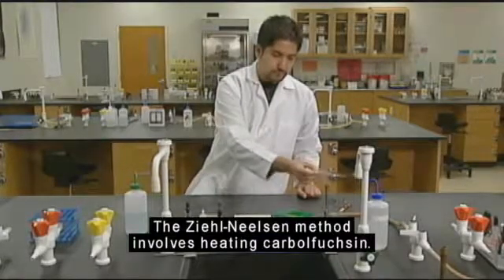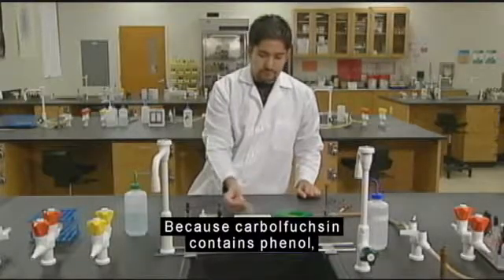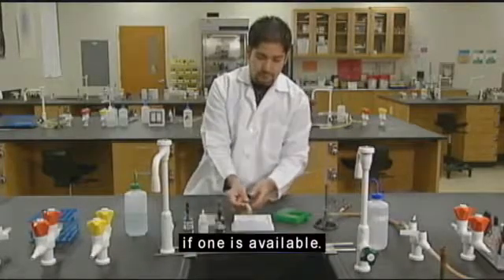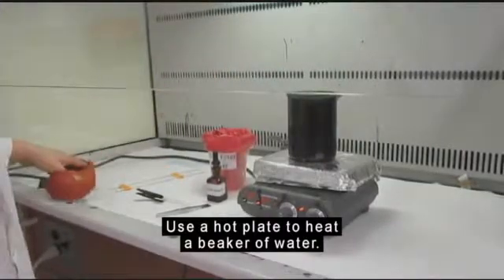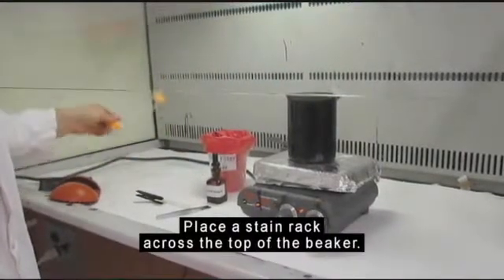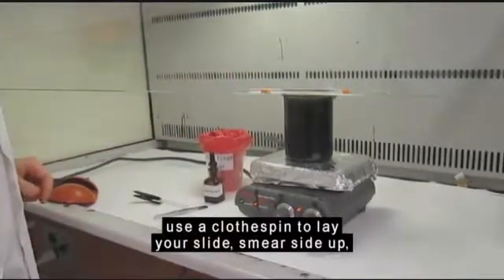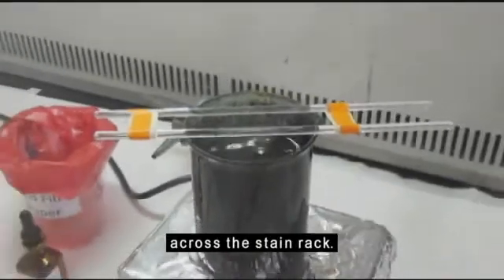The Ziehl-Neelsen method involves heating carbolfuchsin. Because carbolfuchsin contains phenol, you should do this heating step in a fume hood if one is available. Use a hot plate to heat a beaker of water. Place a stain rack across the top of the beaker. Once the water is boiling, use a clothespin to lay your slide, smear side up, across the stain rack.